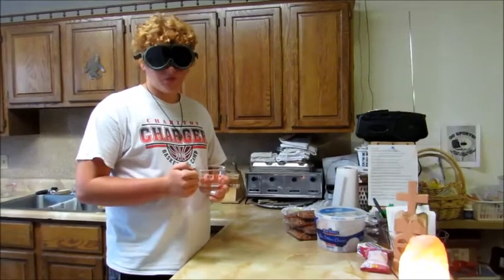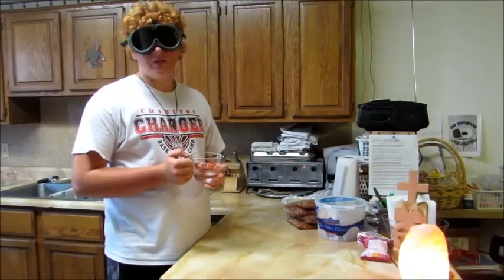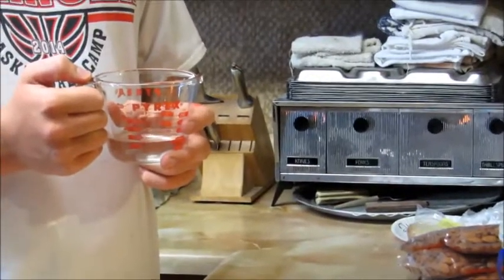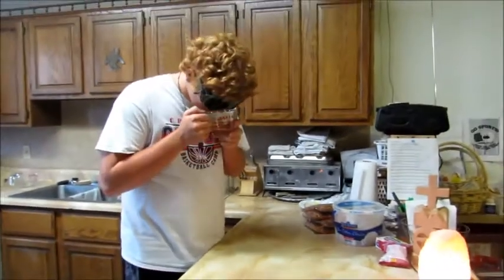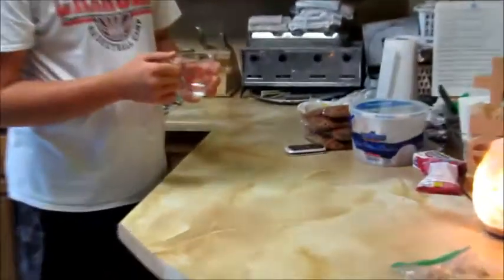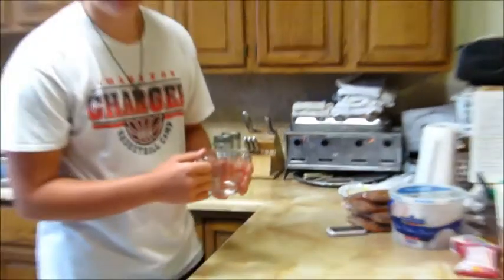Inhale fumes from a liquid or any other substance in a beaker when instructed to by your teacher. All right, class, go ahead and take a whiff of your concoction. Sweet. Hey, Mr. Jones, can we sniff this? Absolutely not. It's a very dangerous chemical. Sweet.